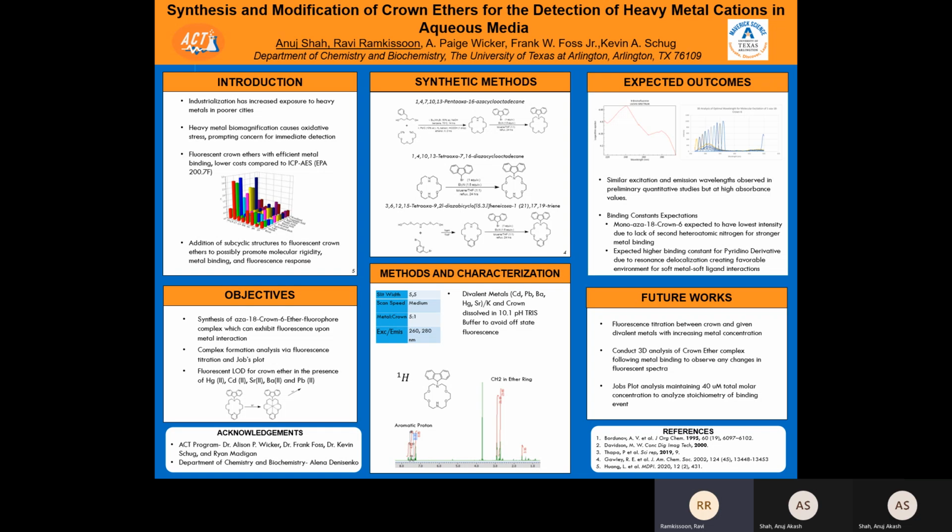So once we finished synthesis of our molecules, we characterized them using proton NMR, and the two signals below illustrate that we did synthesize our molecule and that we did get close to literature results. So once we were able to do that, we moved on to our three-dimensional analysis. And so what this did is the spectrophotometer essentially excites the molecule, and then it releases a photon of light, also known as its emission.